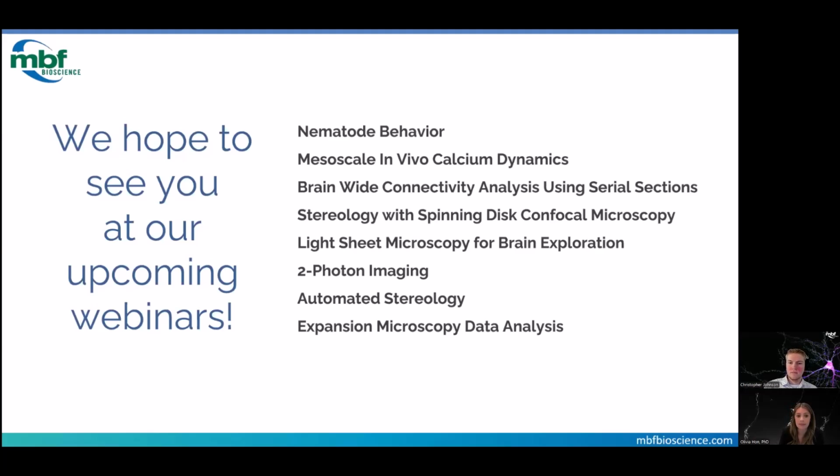Awesome. Yeah, the one thing that you do want to be a little careful of with these types of experiments is if you're using a non-specific cation channel, like channelrhodopsin or Chrimson, the stimulation could induce a peak and you could accidentally create a positive feedback loop in your setup. So it is important to do some titration experiments to see what effect stimulation, say at 1 millisecond at X laser power, has on your signal. And you might want to blank out some of those areas from your closed loop setup.